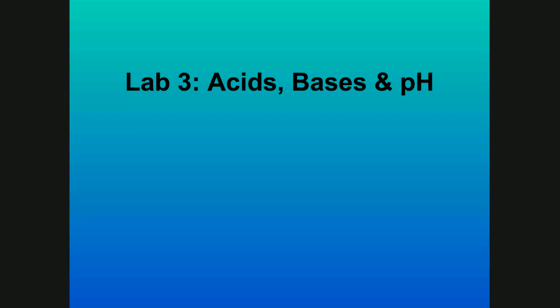Hello everyone, I'm going to begin the Lab 3 overview for 1408. Lab 3 is pretty straightforward as long as you read the information and review the information it asks you to review, but it's the acids, bases, and pH lab.